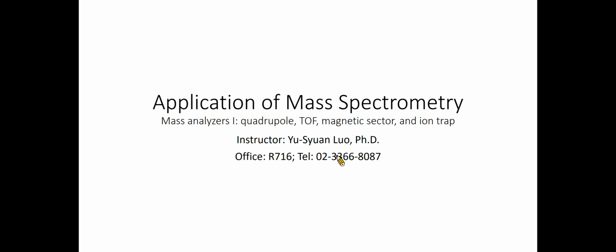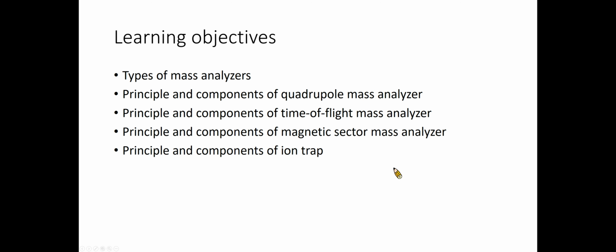In today's lecture, we are going to enter the world of mass spectrometry. You will learn the general types of mass analyzers, the principle and components of quadrupole mass analyzers, time-of-flight mass analyzer, magnetic sector mass analyzer, and ion trap.